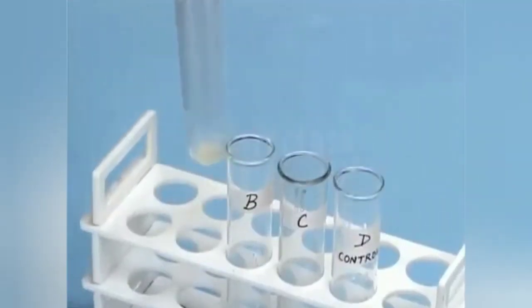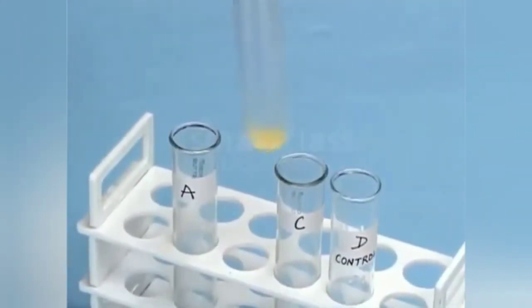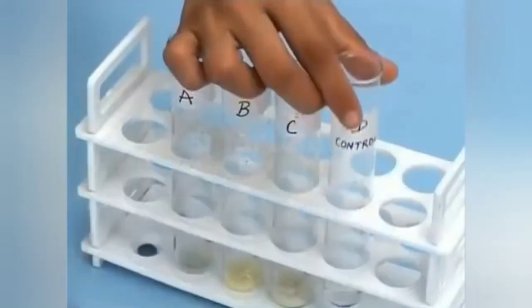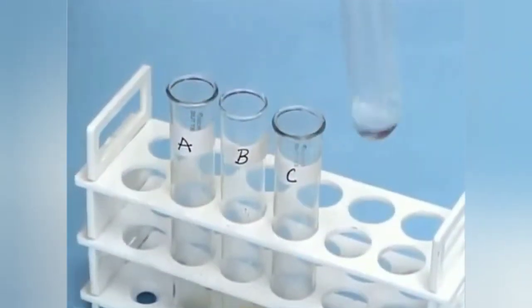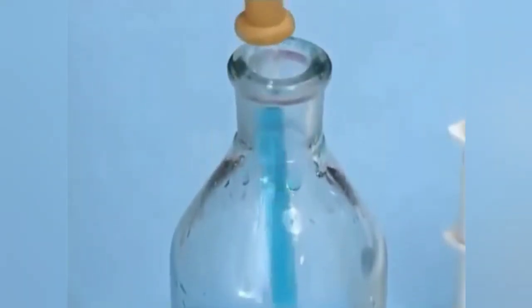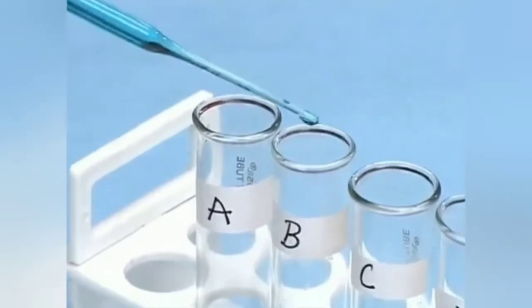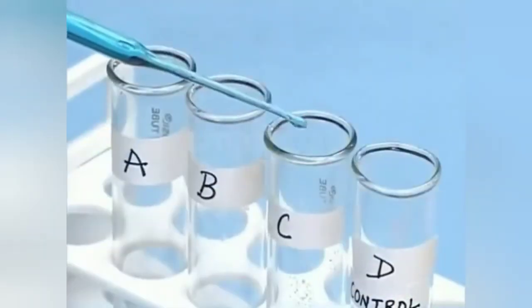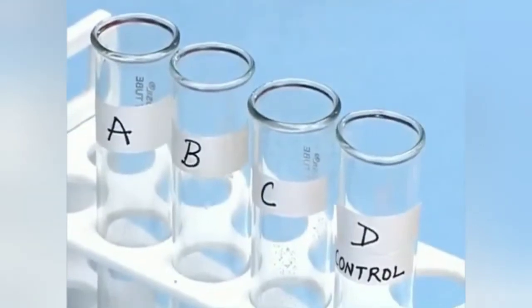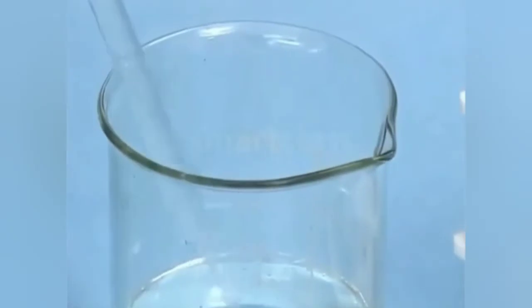Shake all the test tubes well. Now, with the help of dropper, add 2 drops of copper sulfate solution and few drops of caustic soda to each test tube.